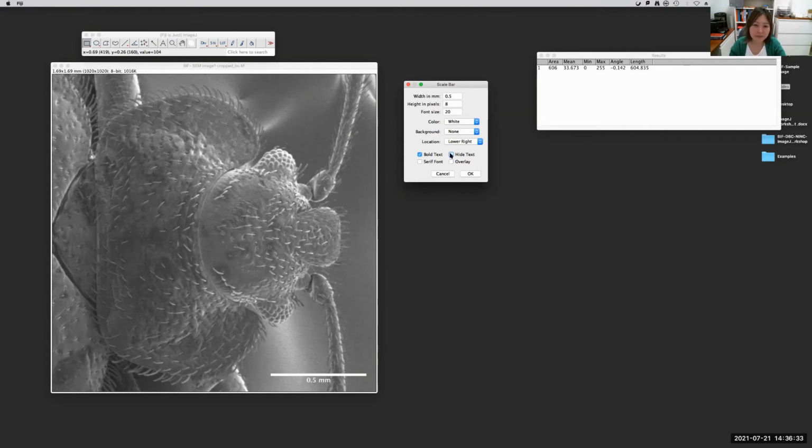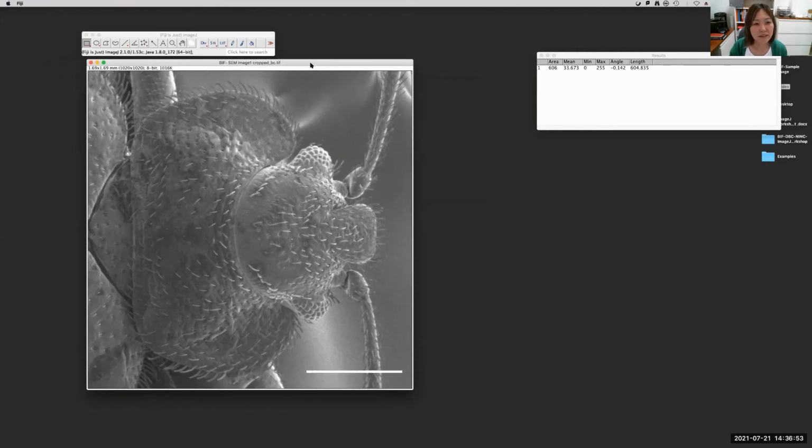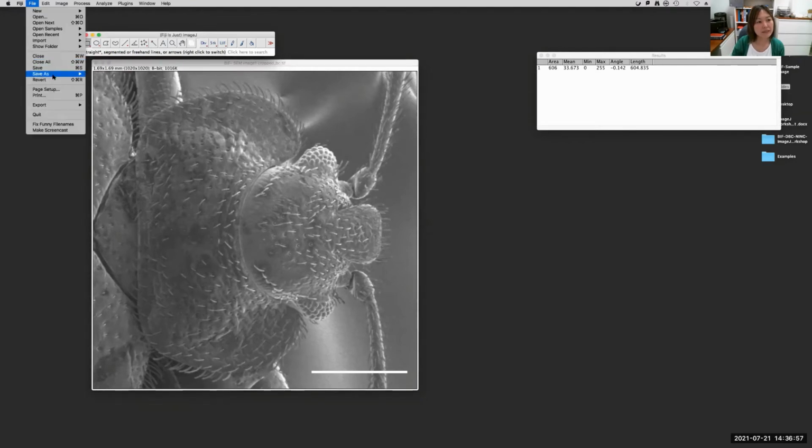Or you can put text. Well, I will hide text. Then hit OK. Then I will save this image.